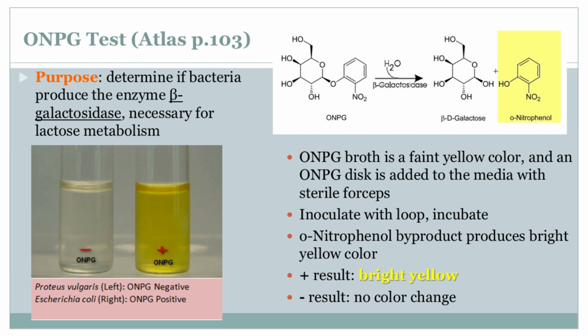It's also super important in food science, especially for things like making yogurt and cheese. Because believe it or not, not all bacteria are good at making yummy dairy products. Wait, so some bacteria could turn my yogurt into something gross? Well, maybe not totally gross, but let's just say they might not give you the flavors you want. Or even worse, they could be harmful. The ONPG test helps make sure that the bacteria being used are the good kind, like certain lactobacillus species. Those are the ones that break down the lactose and make yogurt taste all tangy and delicious.